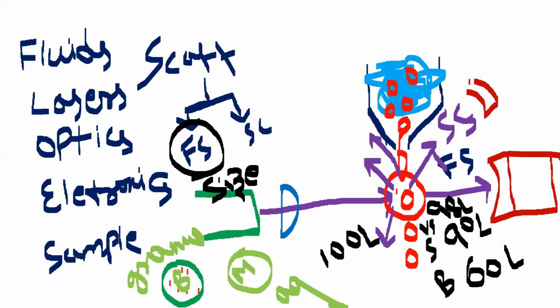Only a granulocyte will provide us the side scattered light. So detection of side scattered light will give the complexity of the cell. If a monocyte is passing, it won't give any side scattering. So absence of side scattering indicates a monocyte. Presence of side scattering indicates a granulocyte. And the intensity of side scattering indicates various types of granulocyte.